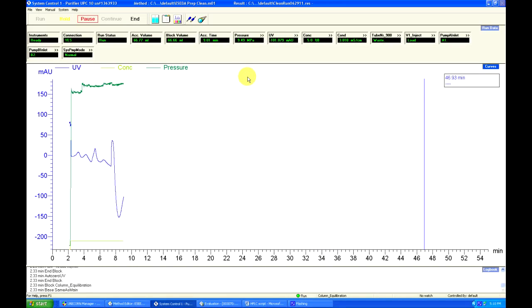While the run is going, we have some extra options in the top left corner. We can press the Hold button to hold the gradient of %SolventB at its current percentage. We can also pause the run by pressing the Pause button for the times when your run just has to wait until you have time to tend to it. There is also the End button, which ends the run. It will ask if you want to save a partial result. The result, along with all other runs, can be analyzed in the Evaluation window.